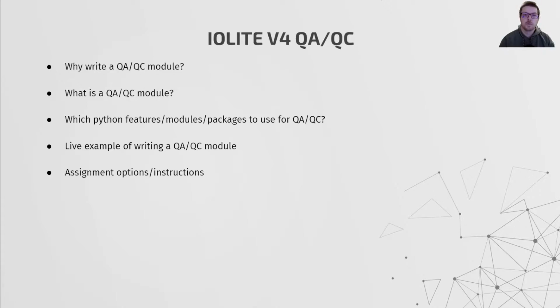In preparation for this week's example and assignment, we'll have a short primer on some Python features that you may not have encountered yet. We will also do an introduction to using Qt to make user interfaces and Matplotlib to make plots. Then, I'll live code an example QAQC module, and finally, we'll discuss this week's assignment.